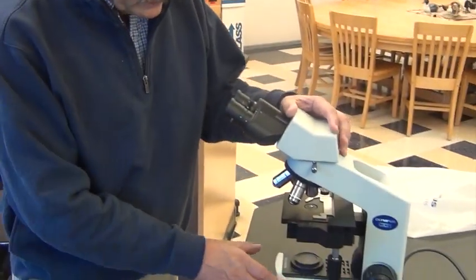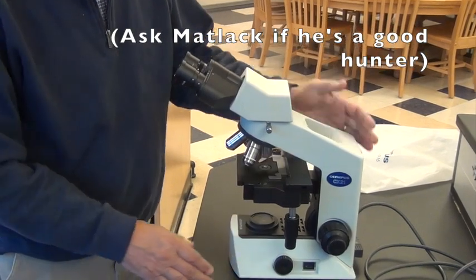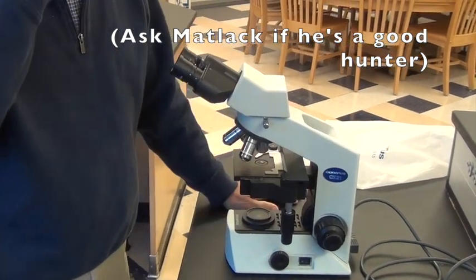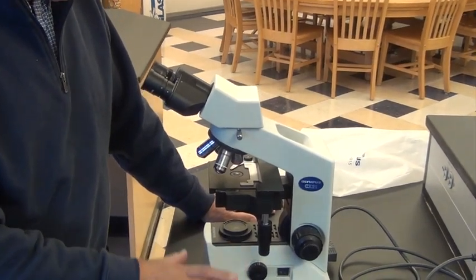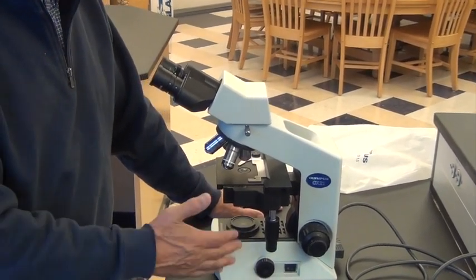Hi, I'm Mr. Matlack. I'm going to show you the parts of a microscope today. This particular microscope is an Olympus. It may be a little more complicated than one of the ones you have, or some of the parts may be in slightly different places, so you'd have to look and compare yours to this.